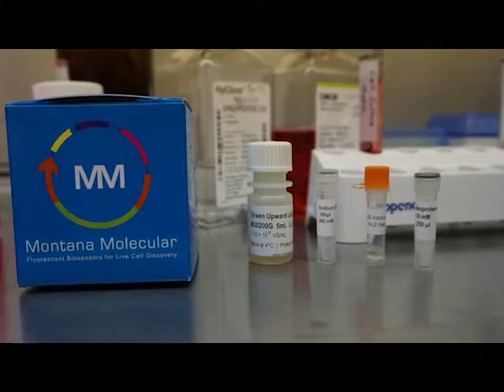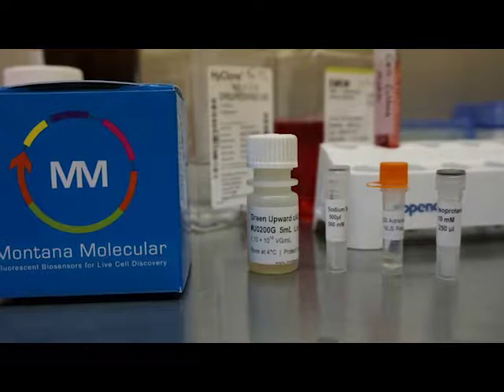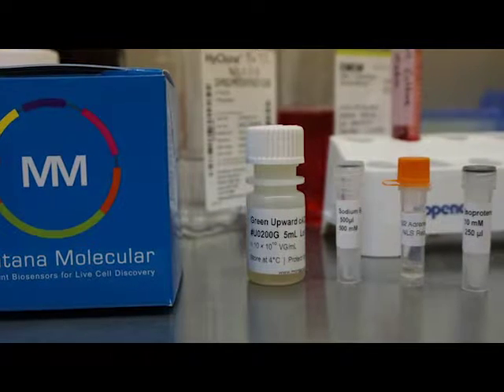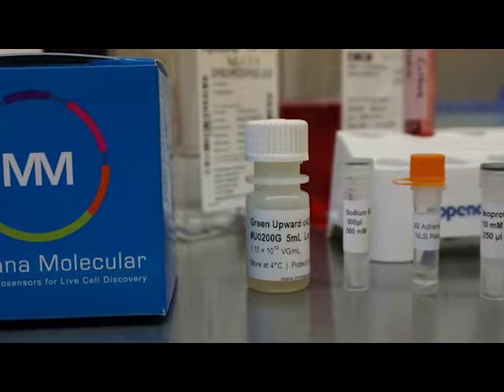In today's experiment, we'll be using the CATIS assay. CATIS is a genetically encoded fluorescent sensor that detects the second messenger cyclic AMP. However, this tutorial outlines the general transduction protocol that can be used for all of Montana Molecular's assays.